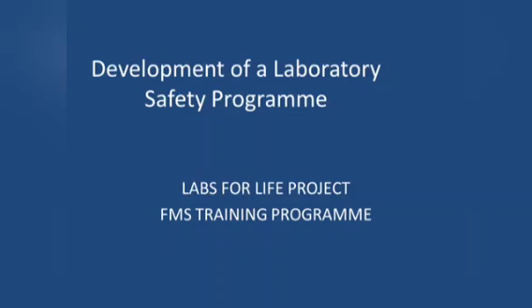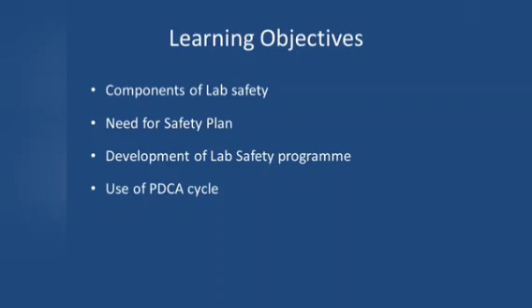Development of a laboratory safety program. In this presentation, we will briefly consider how a safety program should be put in place in a healthcare facility. The learning objectives of the presentation include the components of a laboratory safety program.